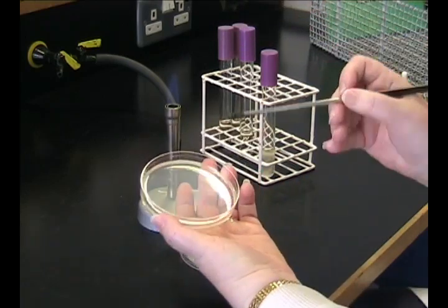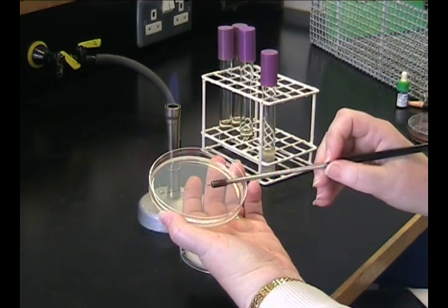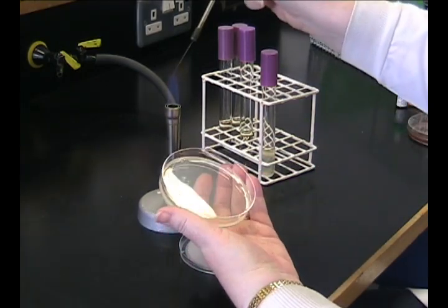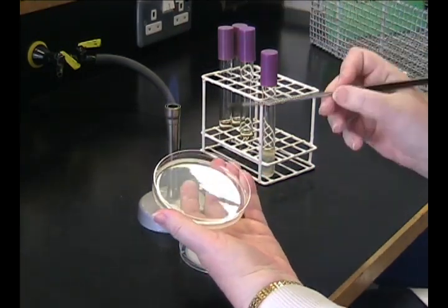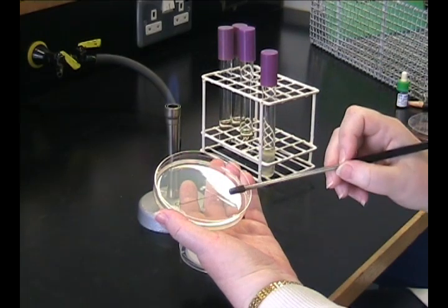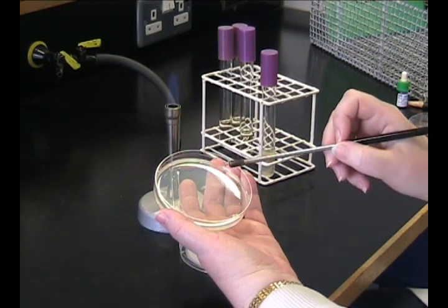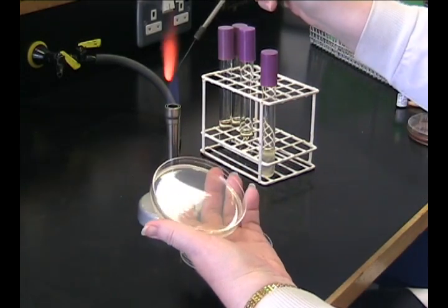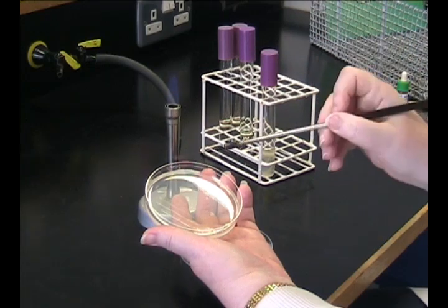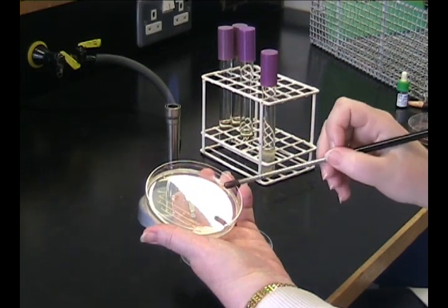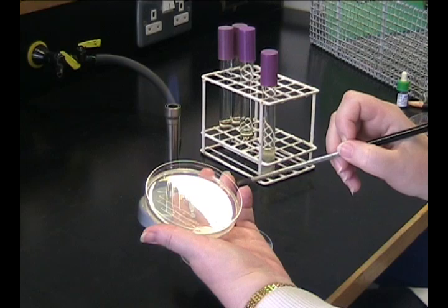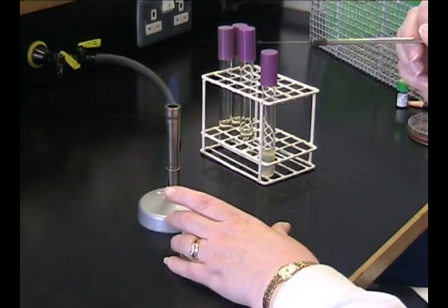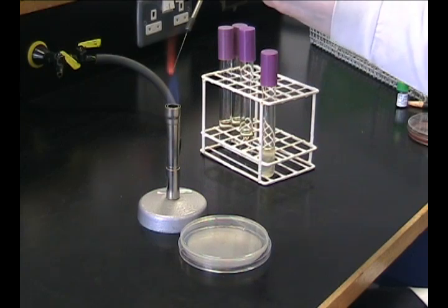You then streak this out onto the plate as before, making your primary streak and then flaming your loop. Rotate the plate, cool your loop, take one streak from the primary streak across the plate. Remember to flame when you rotate the plate. Continue streaking across in order to dilute your bacteria. Always flame your loop at the end.